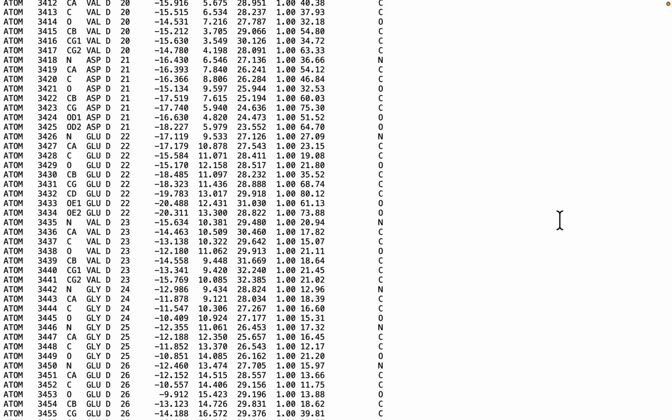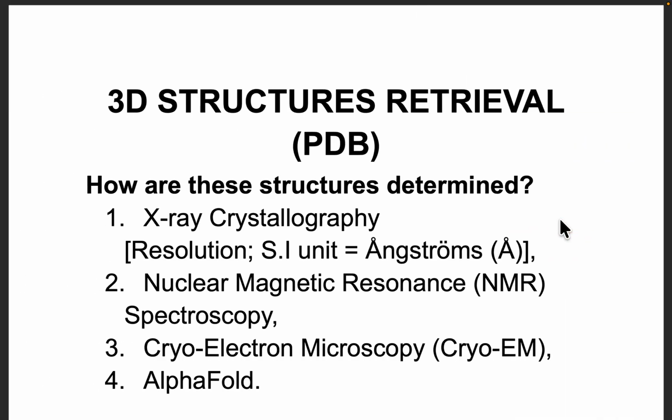At a more advanced level, we can use AlphaFold when there is no experimental structure. It predicts the 3D structure from the amino acid sequence, like we said earlier. And at a more advanced level, we pull this data programmatically, retrieving with BioPython. We load this structure into PyMOL, and that's where the analysis begins. We measure the distance between atoms, we identify mutation sites, we compare two structures by aligning them, and we ask whether a disease-causing mutation actually changes the shape of the protein. This retrieval step that I've gone through is basically the prerequisite for all of that.